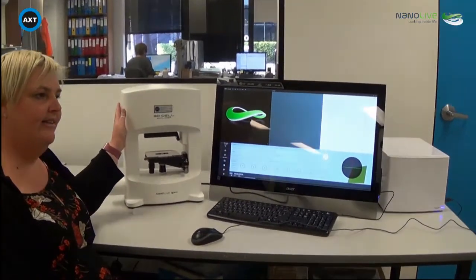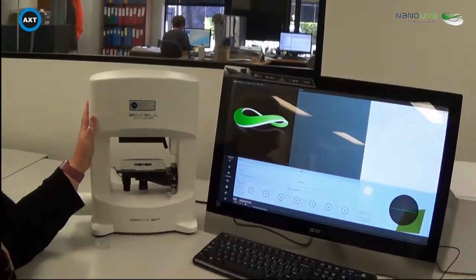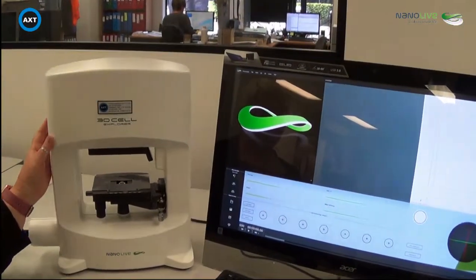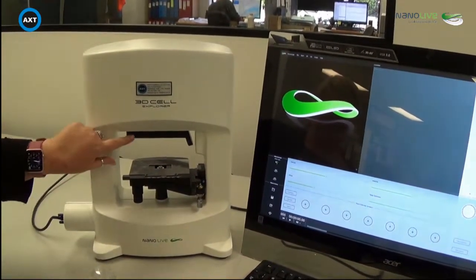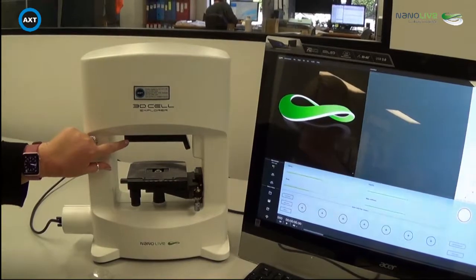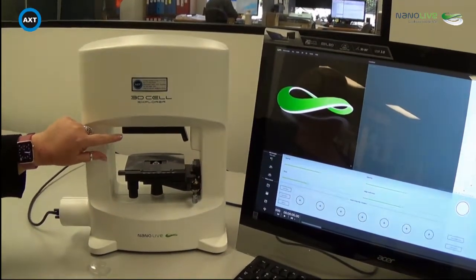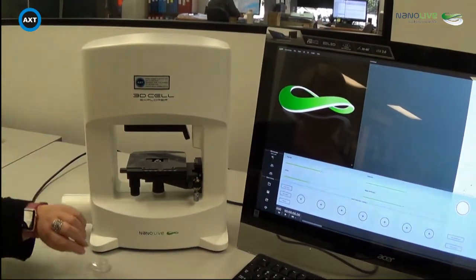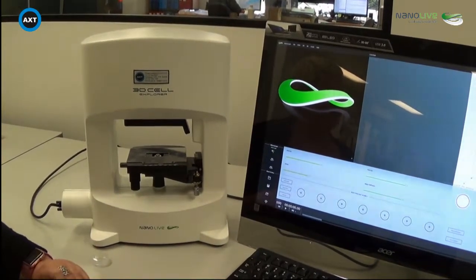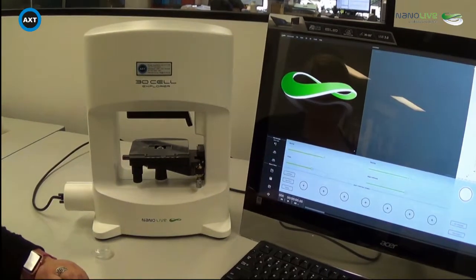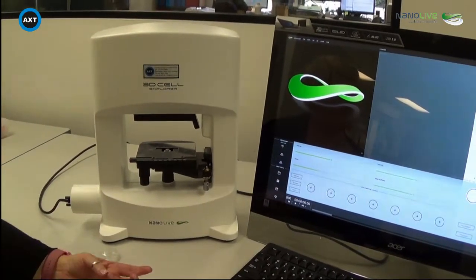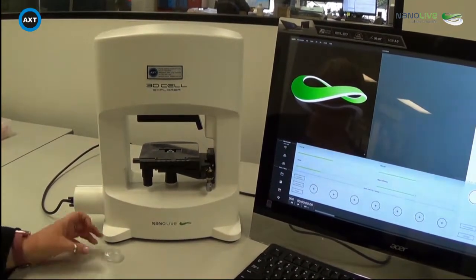This is a microscope that takes 3D and 4D images of live cells and fixed cells. The microscope itself has a rotating arm here. The system uses holographic tomographic microscopy to image your cells in 3D and 4D and requires no stains, markers, or dyes. The way that it's measuring a sample to give you a 3D image is by measuring the refractive index within your sample.